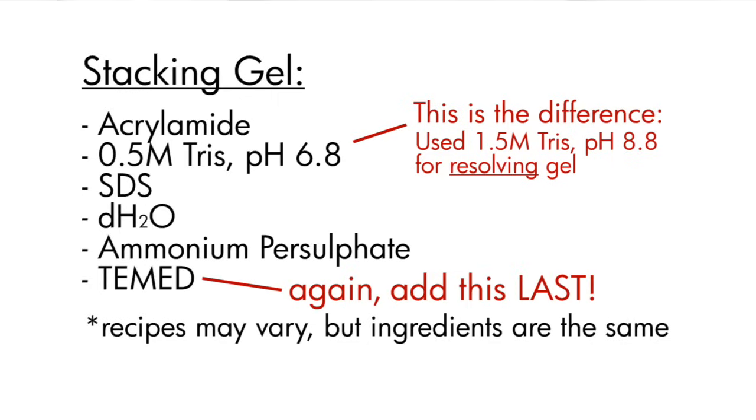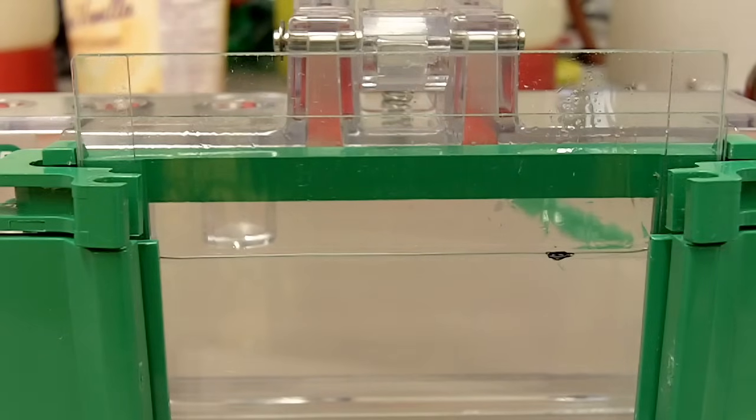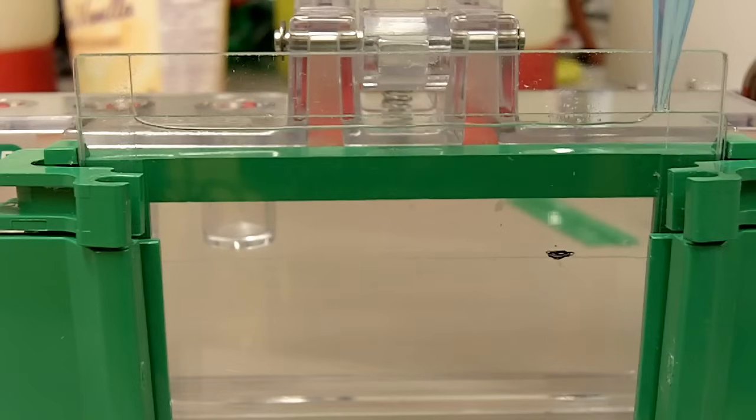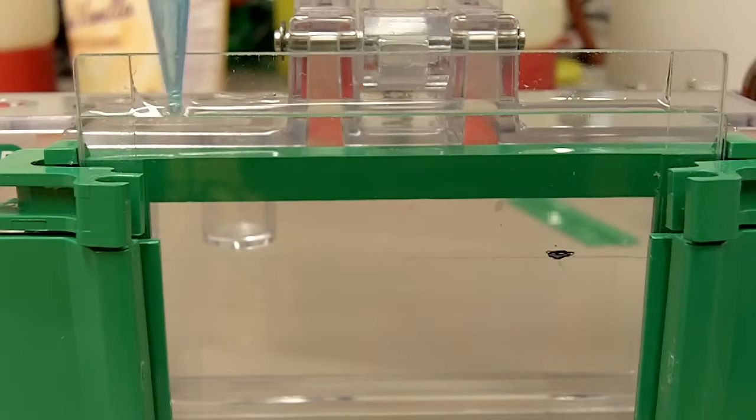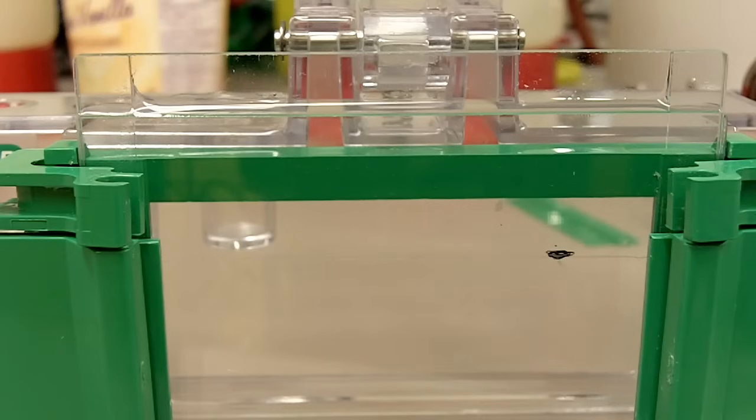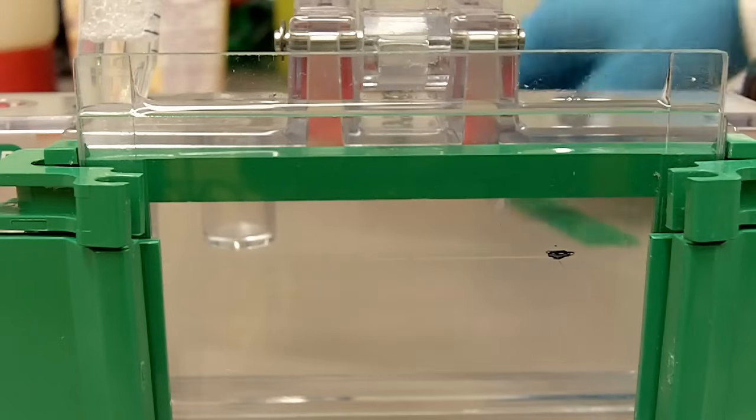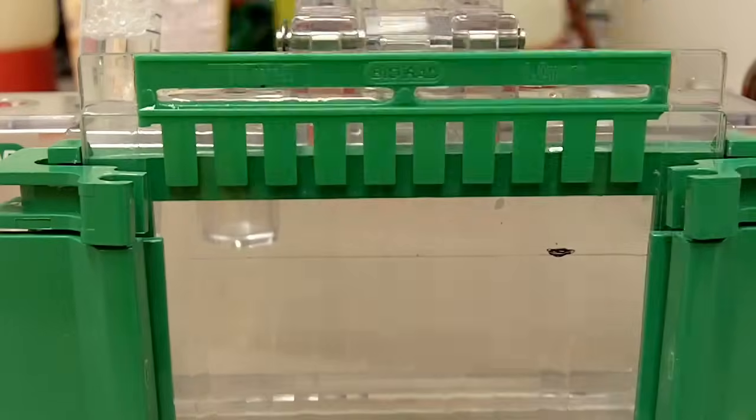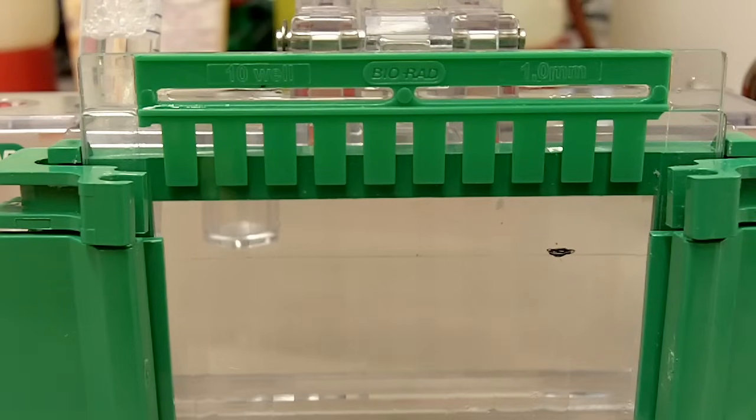So right now I'm going to add TEMED to the stacking gel. So we'll fill out the rest of the plate with stacking gel. We'll fill it all the way to the top like that. Right now you don't want to introduce any air bubbles because it's just going to get trapped. And then we'll put in the comb. And that's how you cast an SDS-PAGE gel.